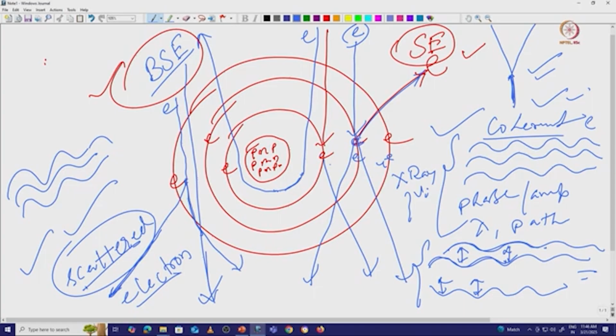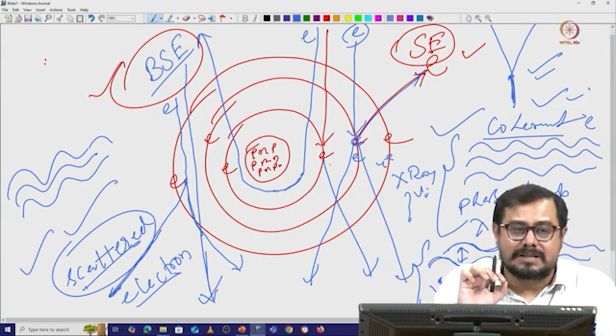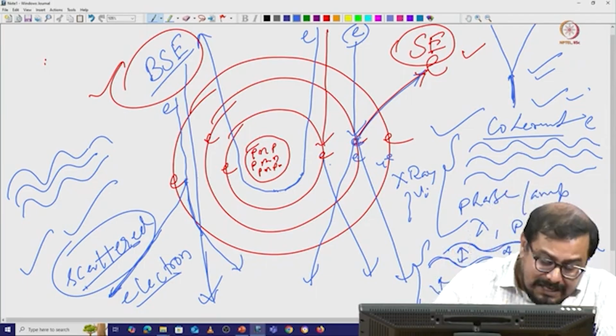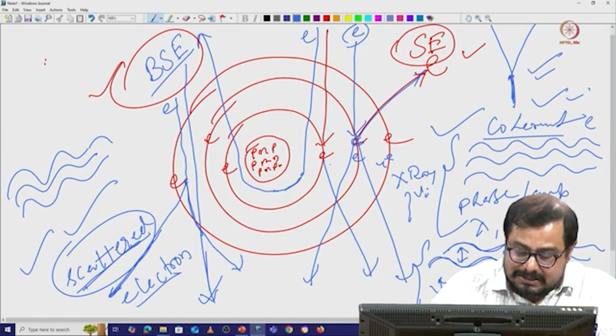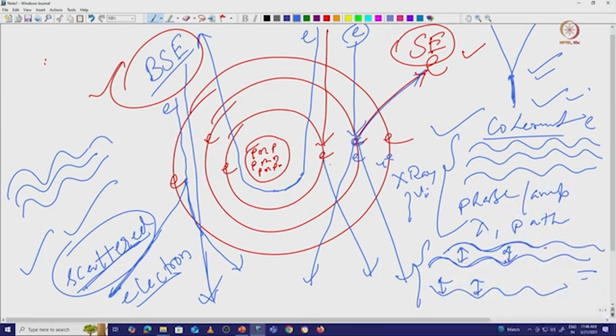So in electron microscopy, there are two types of contrast we are going to discuss. One is amplitude contrast and the other is phase contrast. This phase contrast comes from the scattered electrons, which we are going to discuss at a later stage. The unscattered electron beam and the scattered electron beam are both good, but the inelastically scattered electron beam, which has a different wavelength, path, and phase, adds noise to our images.